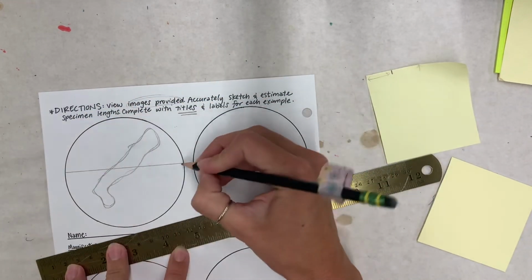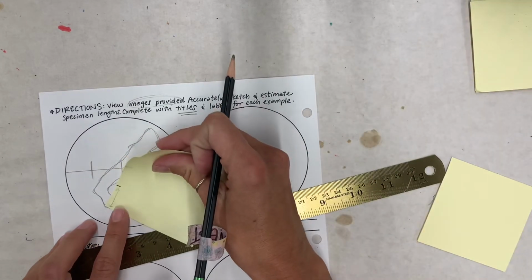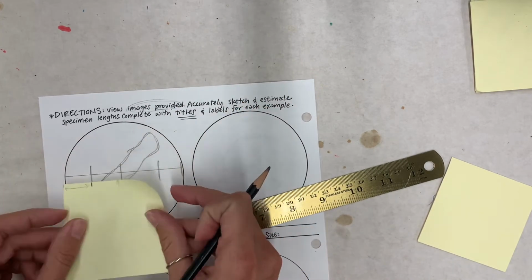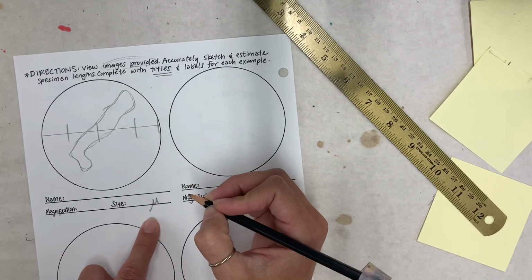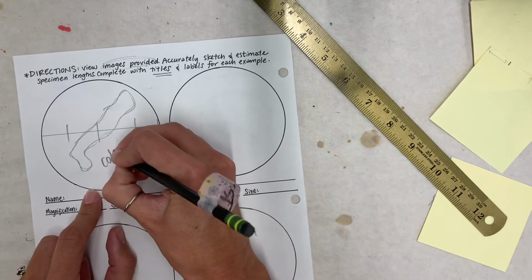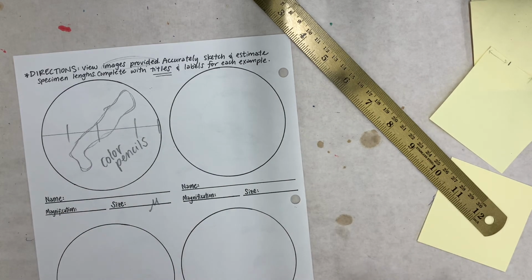You add your numbers. And then you use your Post-it note straight through your specimen. And then you compare that with the scale that you have drawn out. Your size should be recorded in microns. The name should be provided, and use colored pencils and try to draw accurately, please.